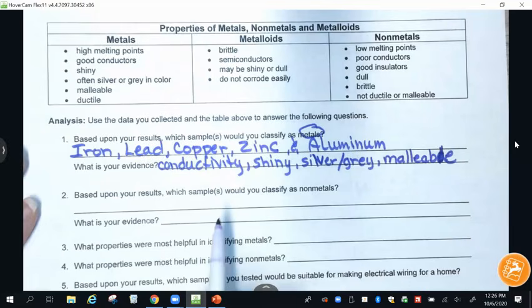Why can't we put copper for color? Because copper, even though we think of it as a color, you can't use that to describe something that is copper because it needs to be descriptive. So a little more, so someone can understand it a little bit better.